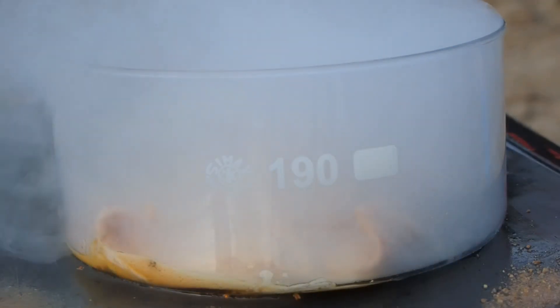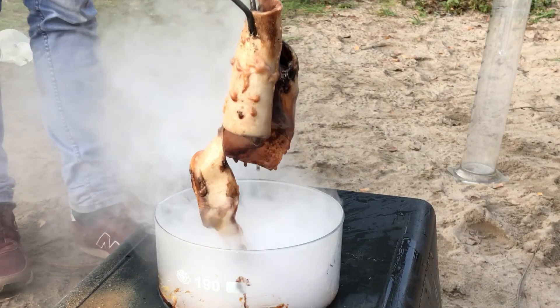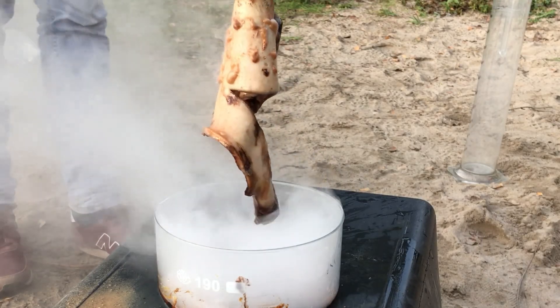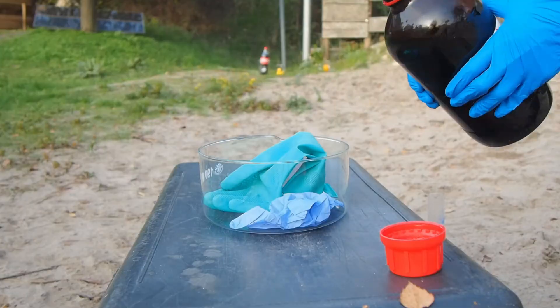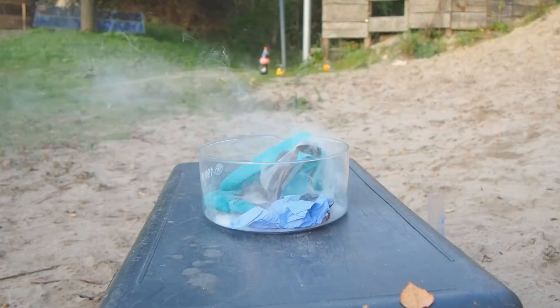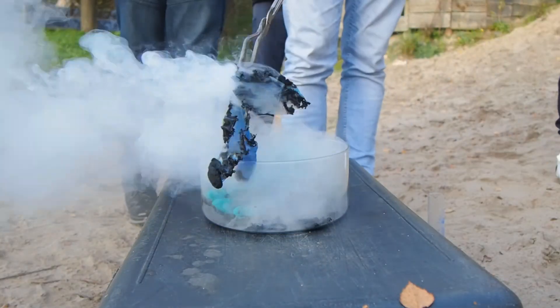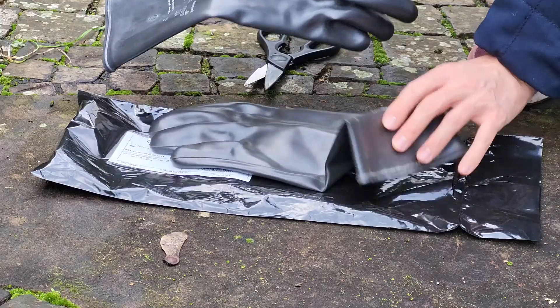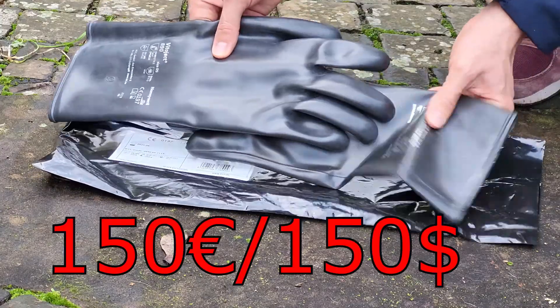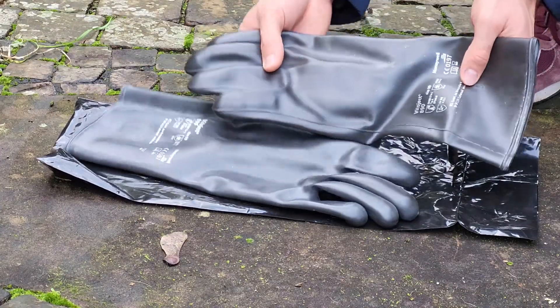You can see that you wouldn't exactly want to get this on your skin — this would be extremely painful. The pig skin was cooked and burned quite thoroughly just by pouring the acid on it. Of course you need to wear gloves, but you can't just wear any gloves. Regular nitrile and latex gloves just get eaten immediately and don't offer any real protection. Only these super expensive thick gloves made of a fluoropolymer are an effective barrier against this acid.